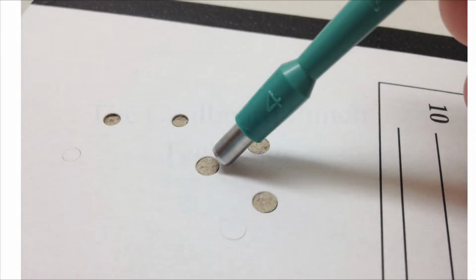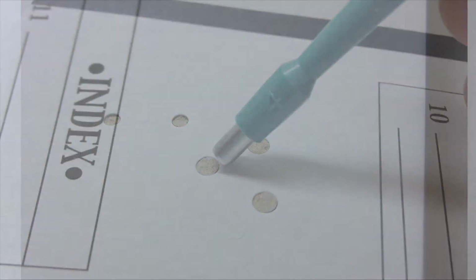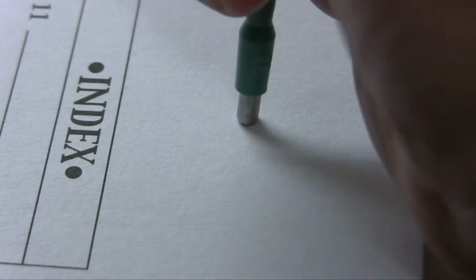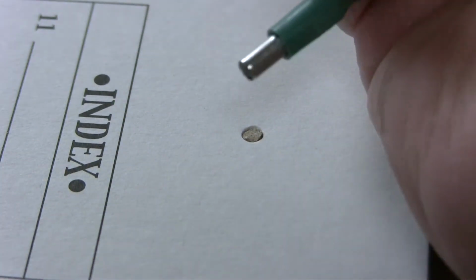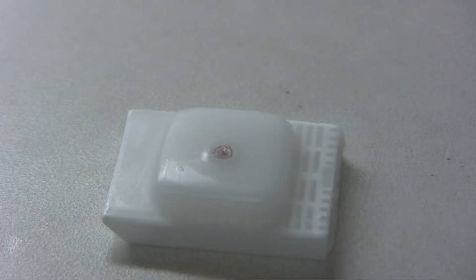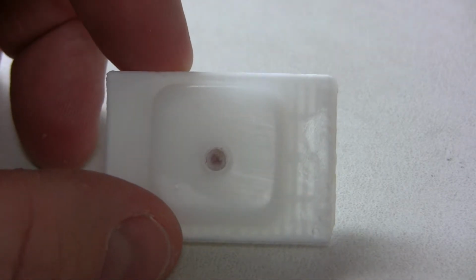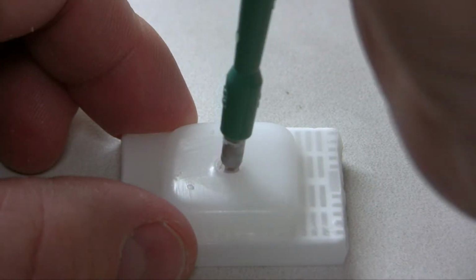When punching an Arraymold TMA with a 3, 3.5, or a 4 millimeter needle, the stylet can leave a dent in the tissue core as it is being extracted. So to protect the tissue, you will need to create a barrier between the tissue core and the stylet. The cardboard from a slide carrier will make an excellent barrier between the tissue and the stylet. You can recycle the cardboard punch. Just put it back in the needle and use it as a barrier as before.